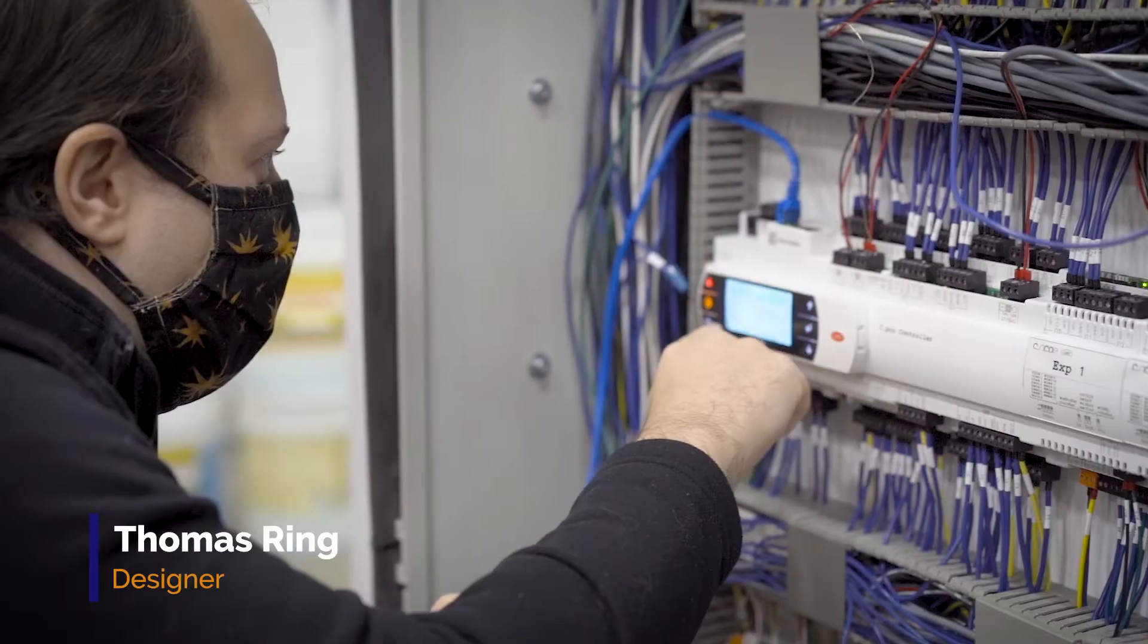My name is Thomas Ring. I'm a designer here at ESC. I'm responsible for designing the air handling units that we produce in-house.